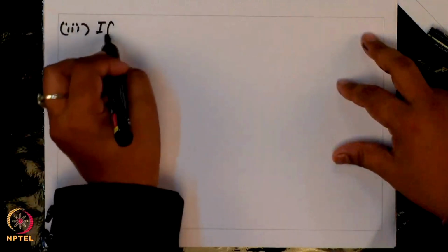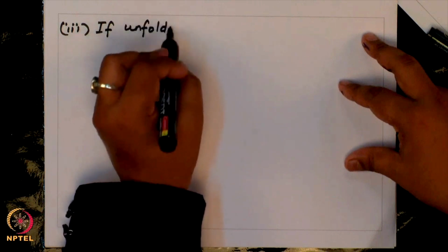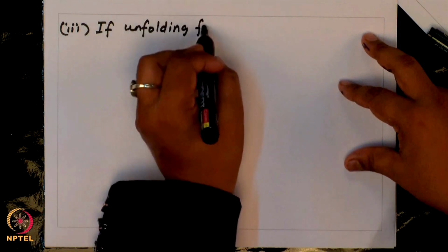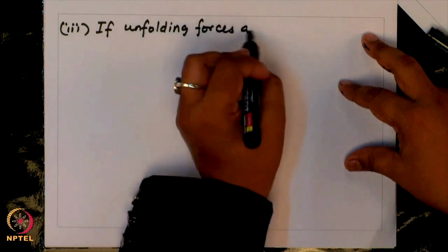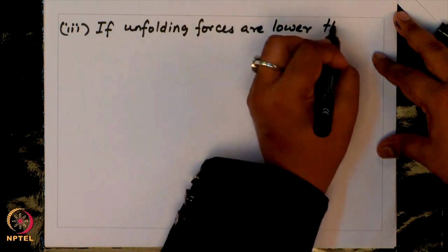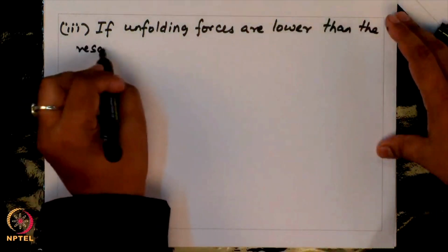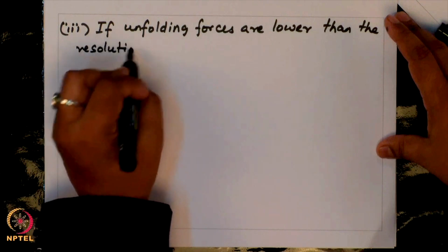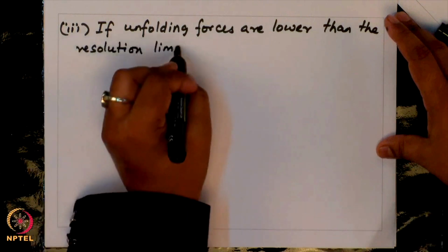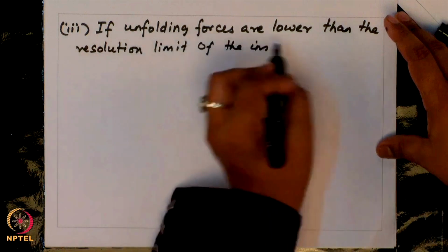If unfolding forces are lower than the resolution limit of the instrument.